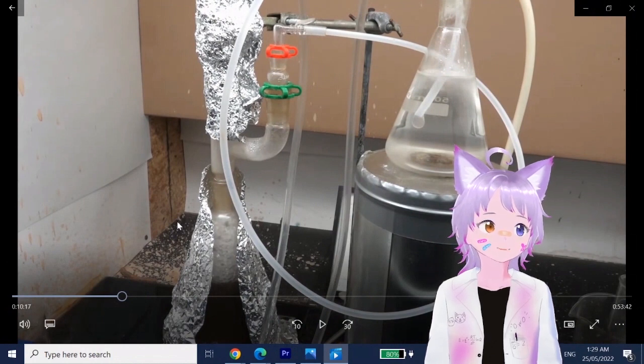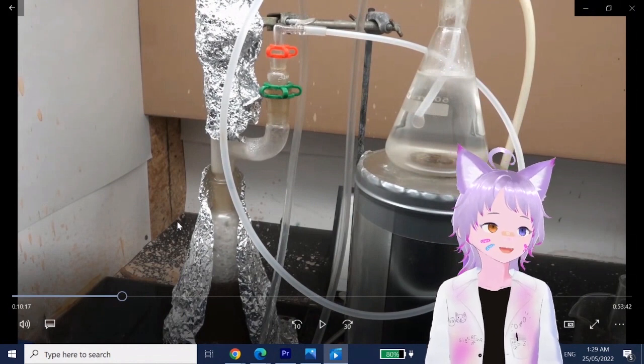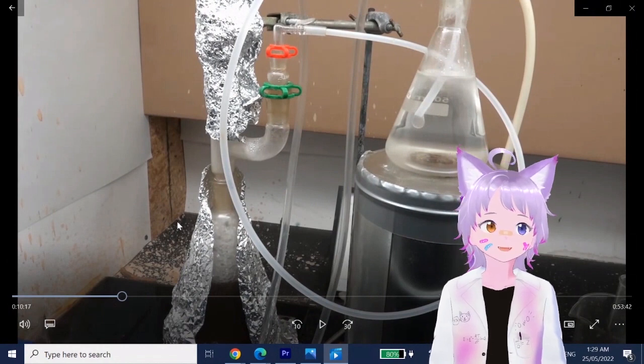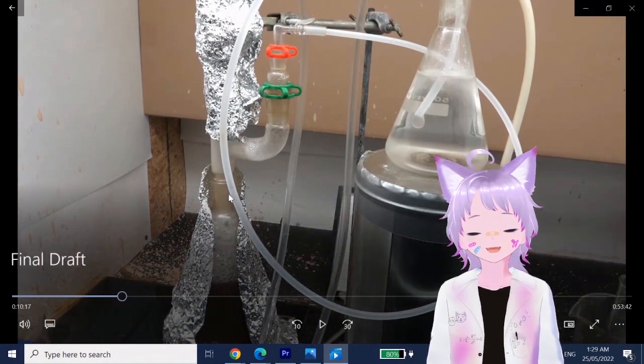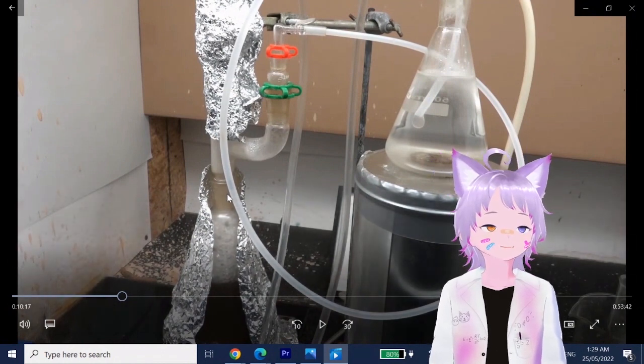But you remember that Dean Stark traps, they have a drain. You can drain out whatever, right? So we could also make it so that once we get a certain amount of water, we can have a drip rate out of the Dean Stark at a very slow enough rate so that we can have continuous removal of water.